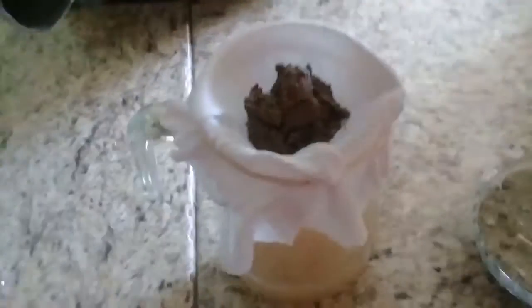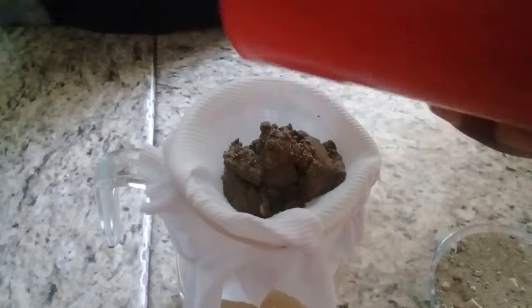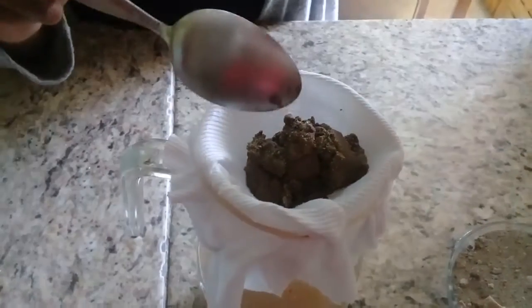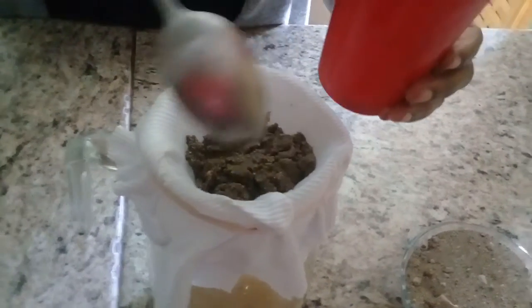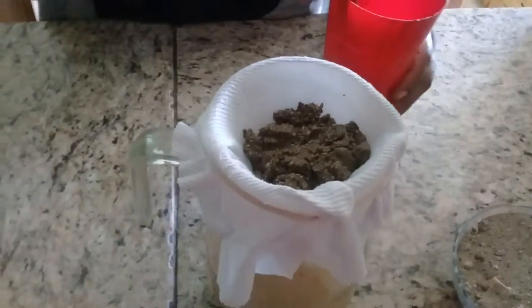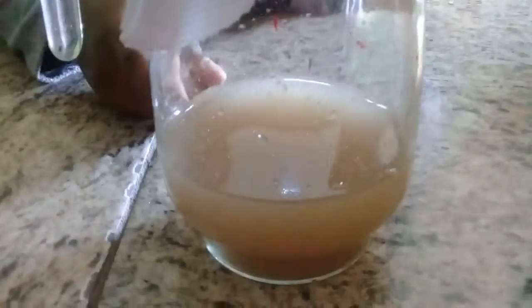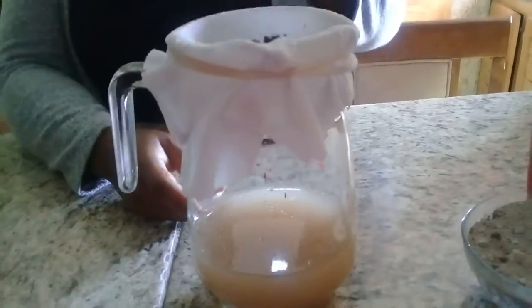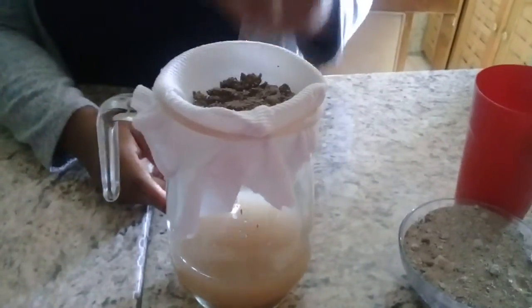I'm just going to use a spoon here to get rid of some of the sand that is there. Notice, most of the sand has been taken out from the container, and what we have is the sand settling on the material used to filter, and the water remains here. So this is the filtration method, which is one method of separating an insoluble solid from the mixture.